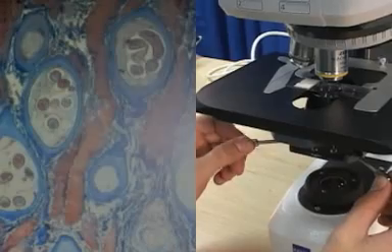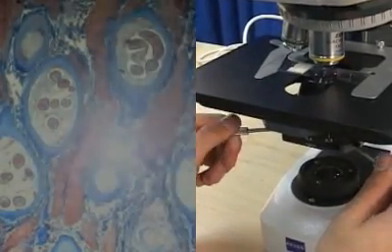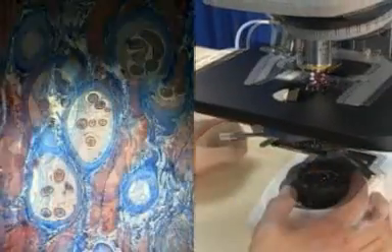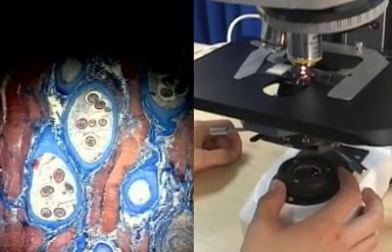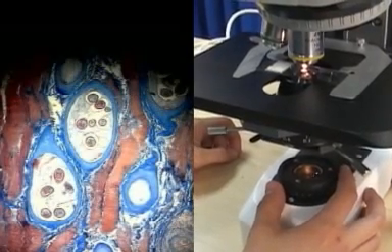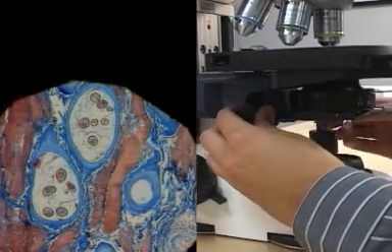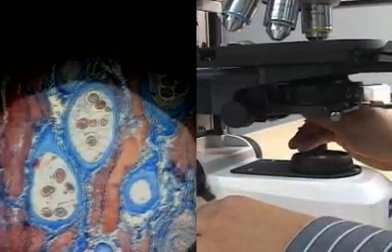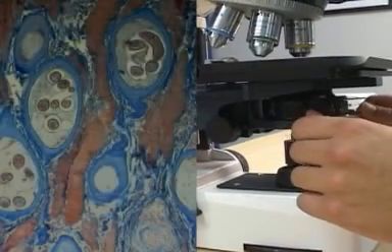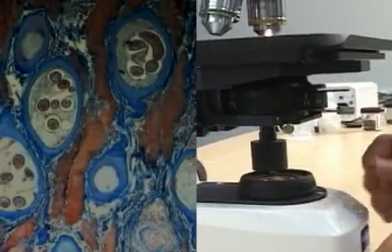If the light spot is not in the center of the field, use the two centering screws on the condenser carrier to move the condenser and center the light spot. With the field diaphragm partially closed, observe the edge of the field diaphragm and see if it is in sharp focus. If not, use the focusing knobs on the condenser carrier to focus the condenser up or down so that the edges of the diaphragm appear in focus. Open the field diaphragm so it is just out of the field of view and adjust the aperture diaphragm for contrast by slightly closing it.